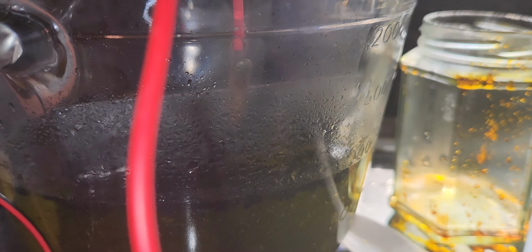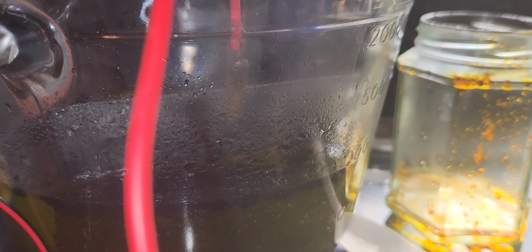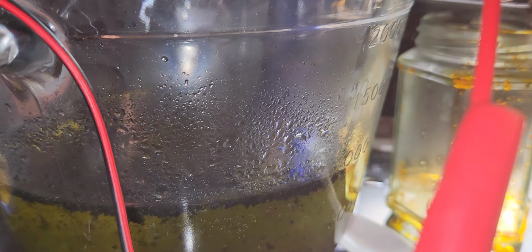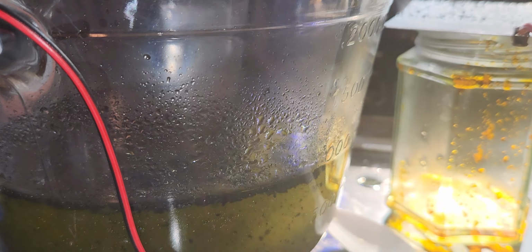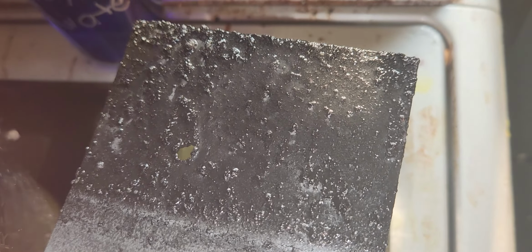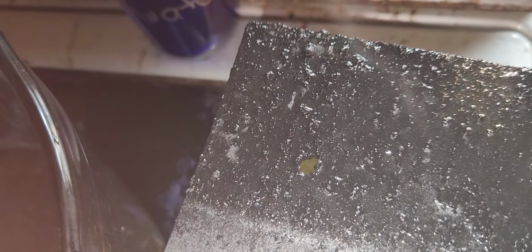Now, I think that's sufficient for now, but I think this is a very good video on, can I take Dragendorff reagent with a copper electrode and Dragendorff reagent and aluminum and create a bismuth plating compound? The answer is yes, I can. That would dry into a coating, and that's a very cool way of making bismuth coating onto aluminum. It is reacting with aluminum, but I can't do much about that.